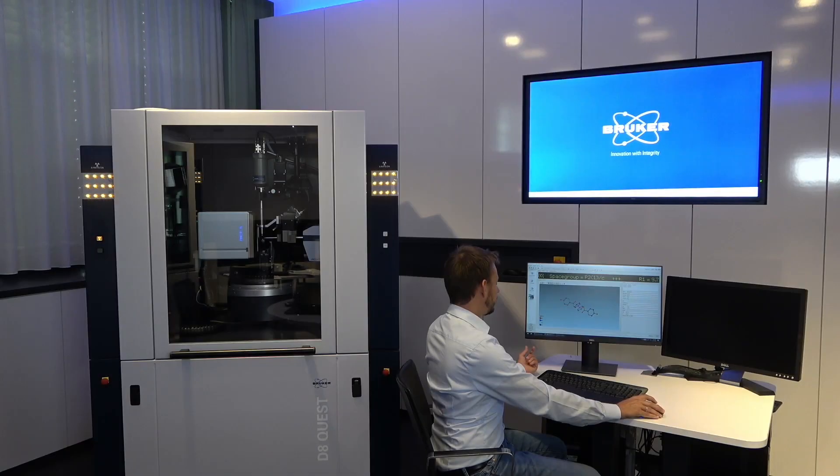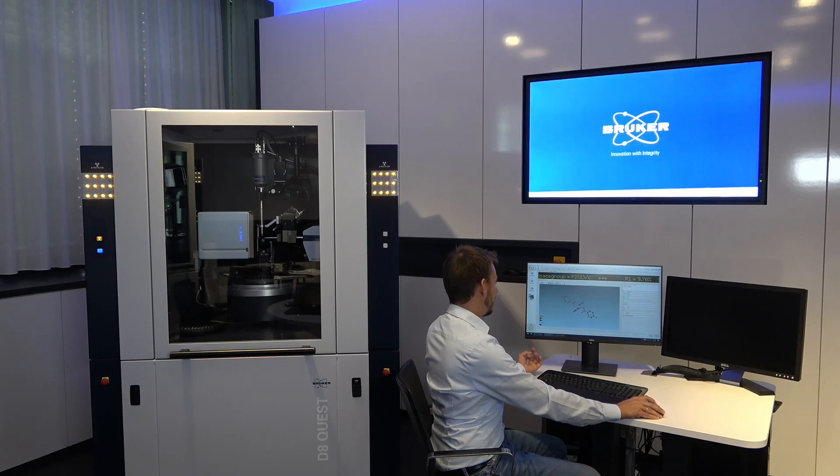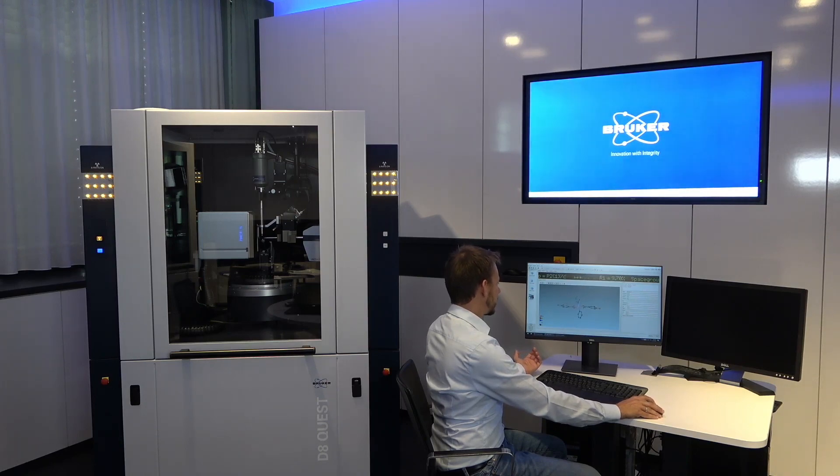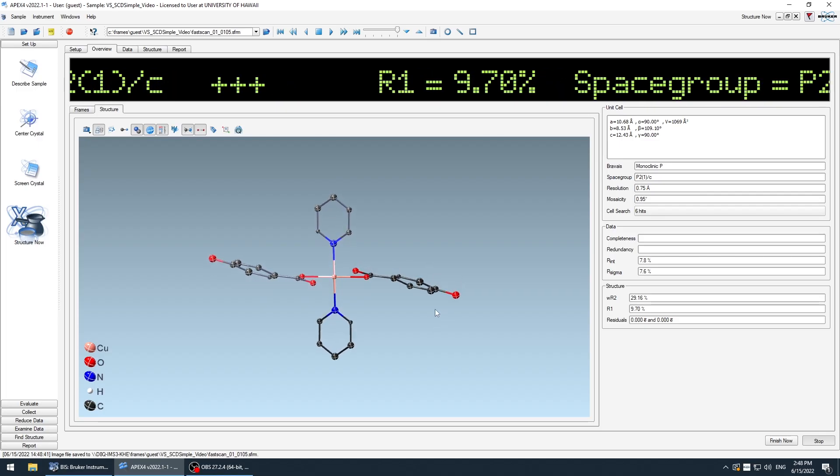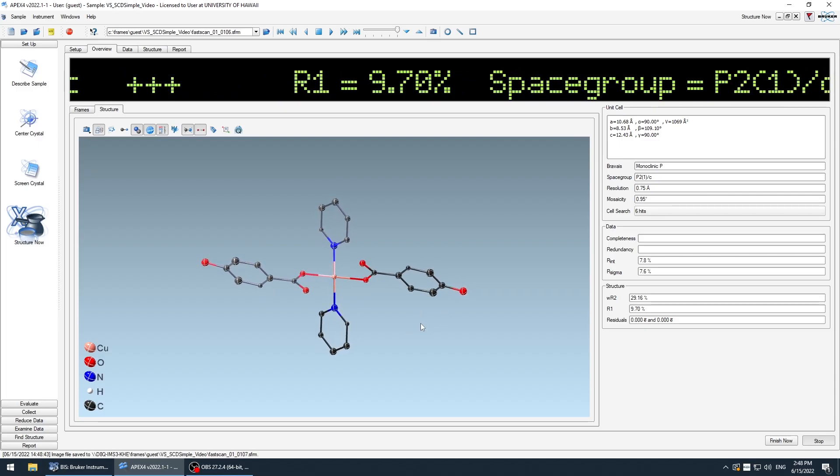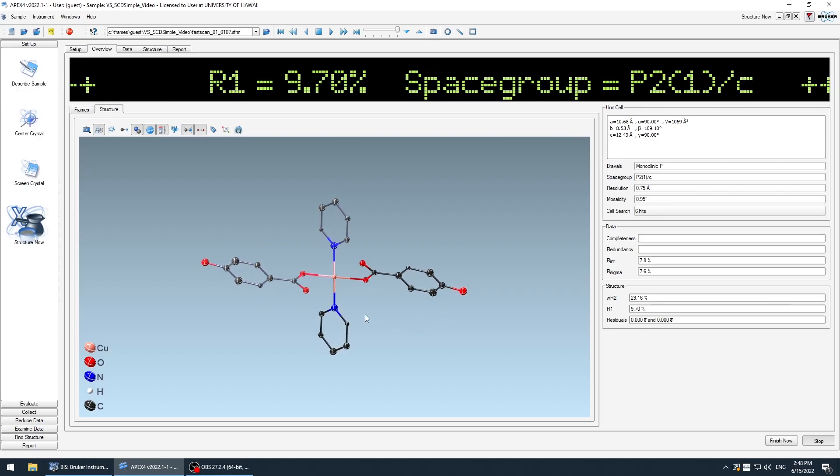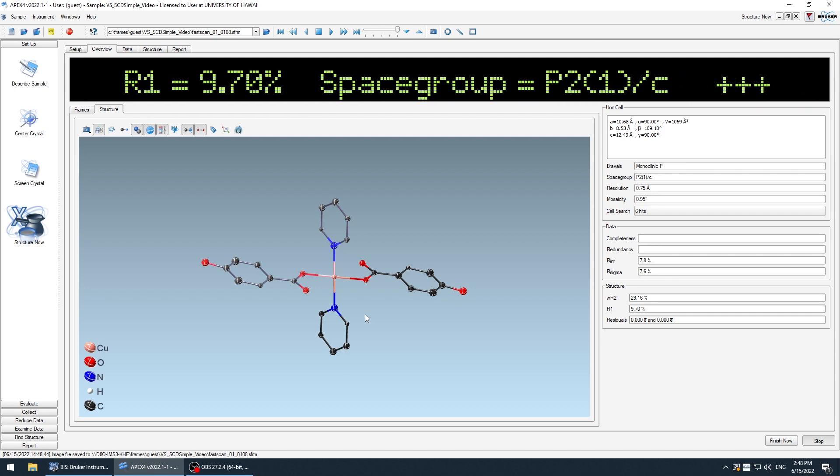We already have our first structure solution. You see it's quite nice. All atoms are correctly assigned. Nitrogen here, oxygen here.